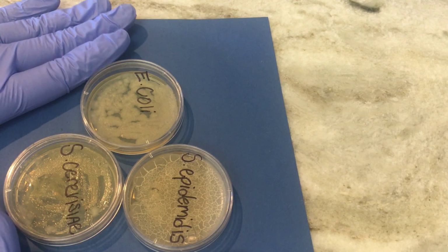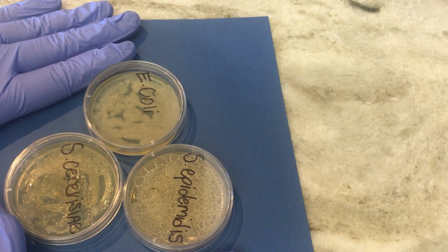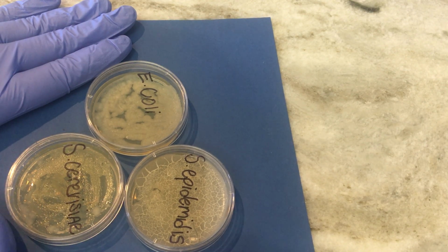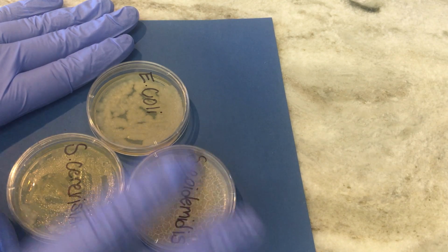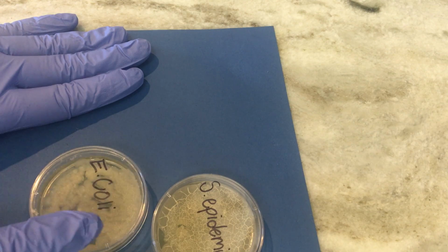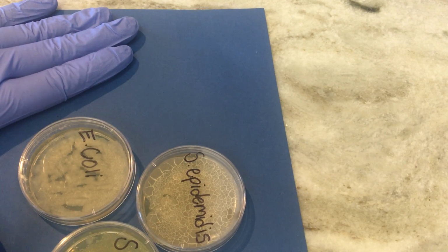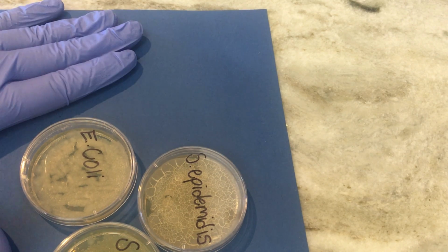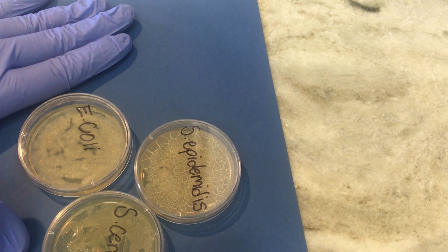And the important thing here is trying to be very clean about it, right? Wash my hands before, using the bleach, using the alcohol, which I did. I placed the inoculation loop in alcohol between each spread. So for example, on this one, we did 4 spreads, right? So alcohol, spread, alcohol, zigzag, alcohol. So I definitely did that. So maybe in the future I need to be a little more attentive and maybe thorough.